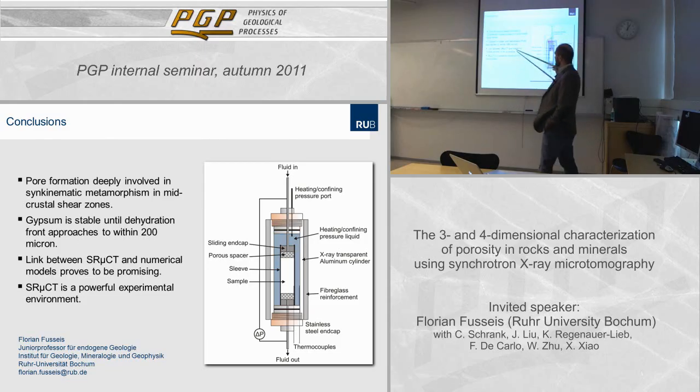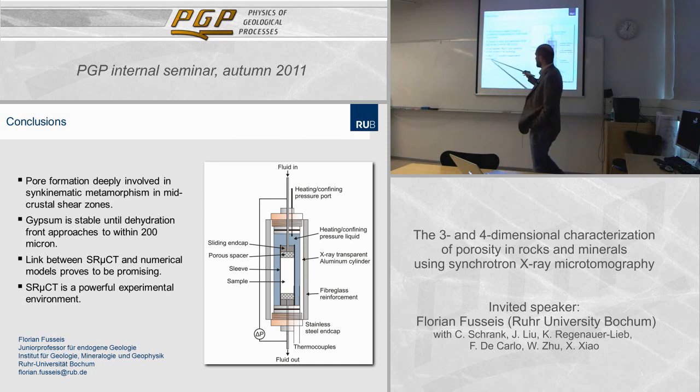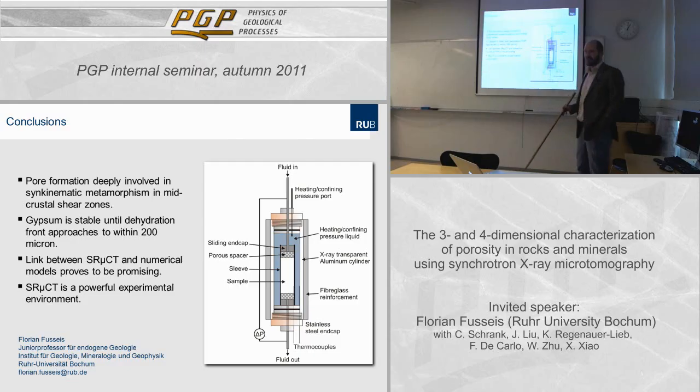What I consider really an achievement is that the link between the synchrotron X-ray tomography and numerical modeling proves to be really promising, and I personally consider that really as a future experimental environment, synchrotron doing in situ 4D studies. And one way to approach that is really to come up with X-ray transparent experimental cells that allow us to study fluid rock interaction or any other process you want in situ in 4D with very high spatial and temporal resolutions.